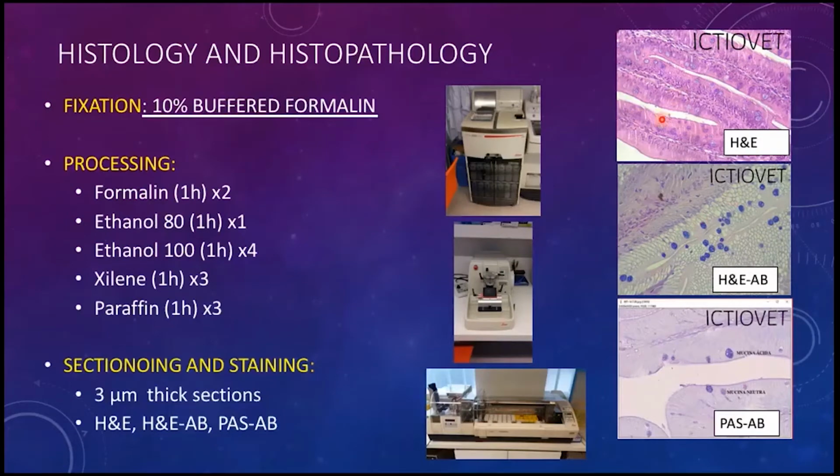Which type of stainings? I would say that hematoxylin and eosin would be the most common one for routine diagnostics, but also for the study of the intestine, as it provides quite good detail of the cells. However, I've also put a couple of other stainings that are more focused for specific purposes, like the study of mucous cells.